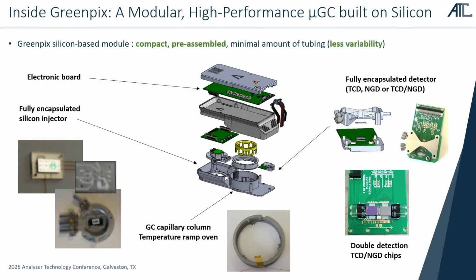Of course, they can do it because of how simple it is. If I go back to the slide that shows the module itself, it's 4 screws, then 4 more screws, and you have access to the column. So as long as they have expertise in changing columns, it's easily accessible. But usually we never do that on site because people don't like to change columns.